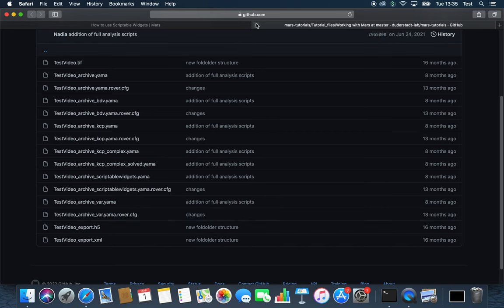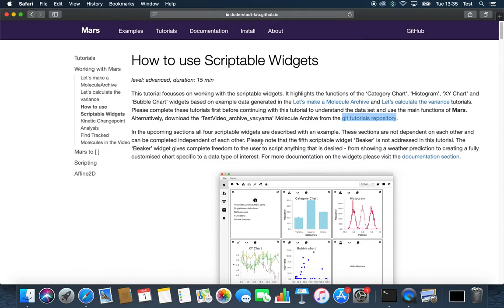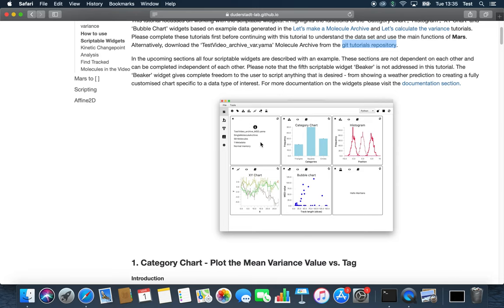We will highlight the option of creating a category chart, histogram, XY chart, or bubble chart. For this I will present four examples to you.